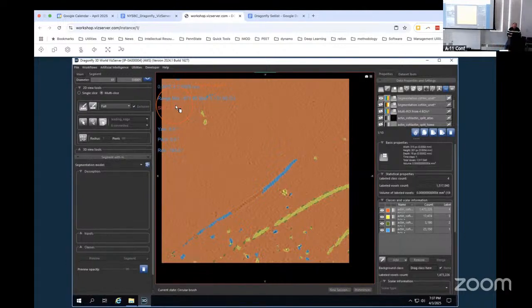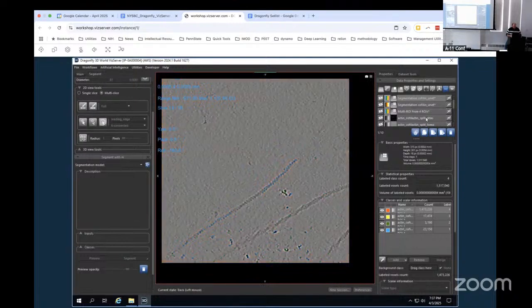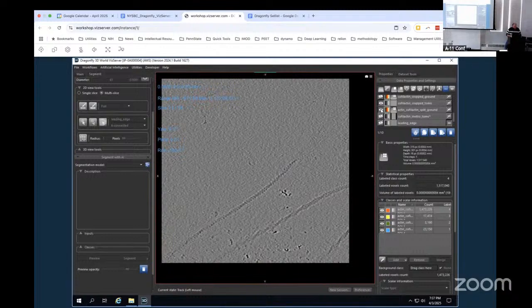So, for the sake of time and getting through more interesting things, how about we just practice setting up training? Let's say that we went through this and we pushed all of these little bits into the background, and that's what I have right here. If you look, you actually have that segmentation.